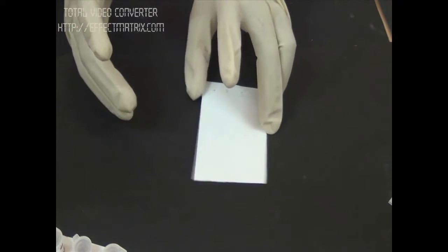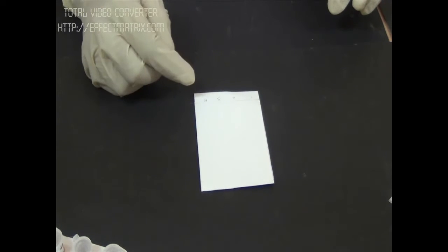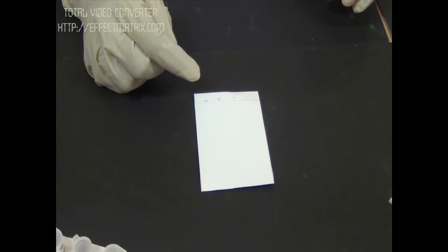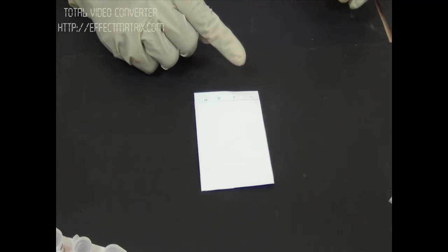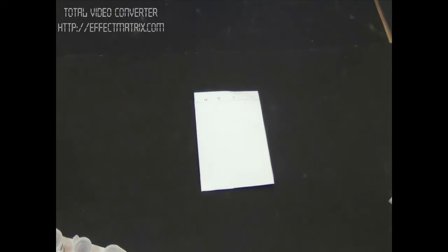We have prepared the line of origin and labeled it as one, two, three, and mixture. We will start with one and subsequently load all four samples.